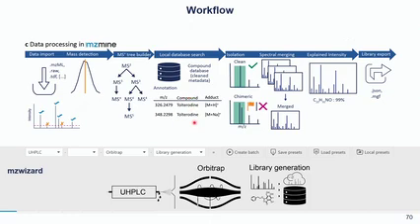We can set up which adducts we very often see in our sample. And then because everything is done automatically, we also have some cleaning steps or some processing steps, so that we know that what we export is actually meaningful, so that it's not just something that seems to correspond to the mass. So you see some steps here. I will also not talk too much about it, but it's just to know what is actually happening in the back. So if we exported something, does it really make sense in the end?